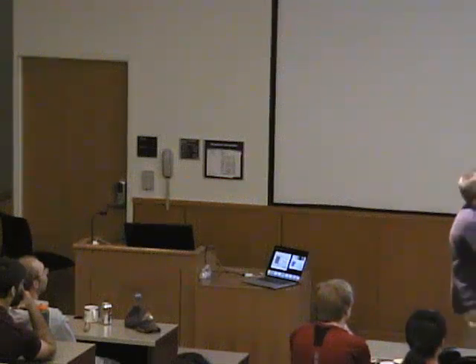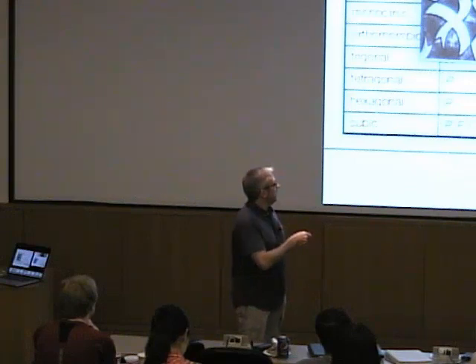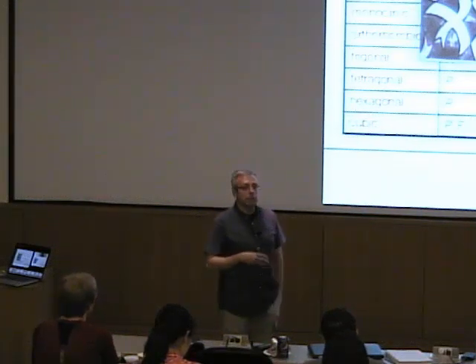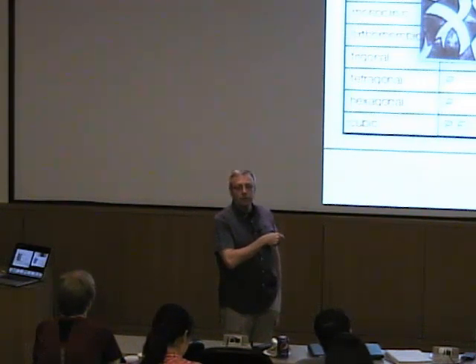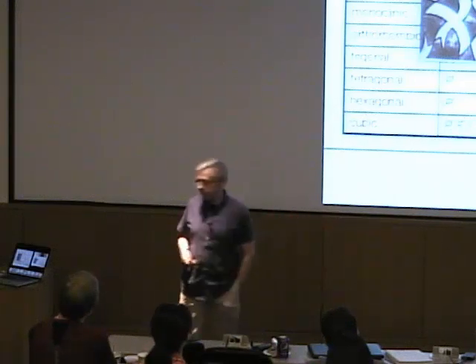And that is all you need to model, because you know that there is a twofold symmetry within your unit cell relating these guys. And that is the difference between what we call the unit cell and the asymmetric unit of the crystal. So the unit cell contains several asymmetric units that are related by crystal symmetry, and the unit cell is the repetitive element, while the asymmetric unit is what we have to put in our model. And this can very well be a pentamer or a heptamer, because the symmetry in here is not a crystal symmetry. That's why it's called an asymmetric unit. Okay, so this is the model we are after in the end.